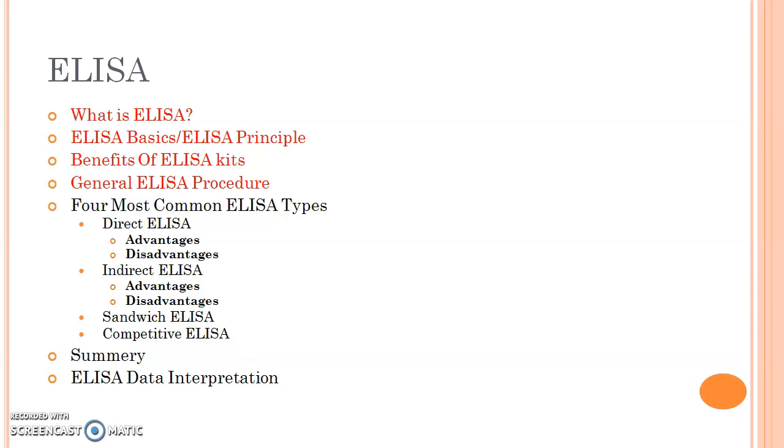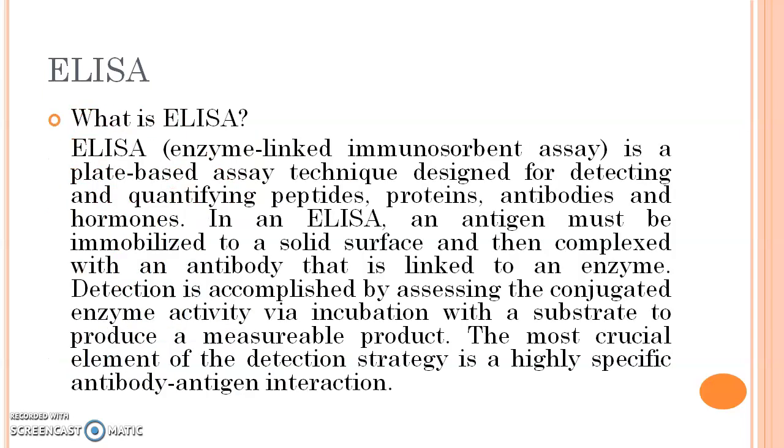This particular video deals with the basics of ELISA, what is ELISA, benefits of ELISA and the general procedure. In the subsequent video, we will see the types of ELISA, summary and data interpretation associated with ELISA.